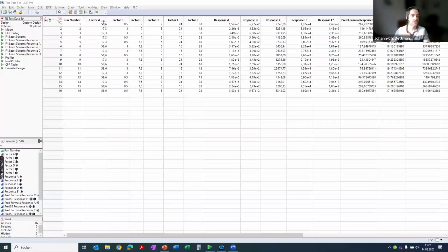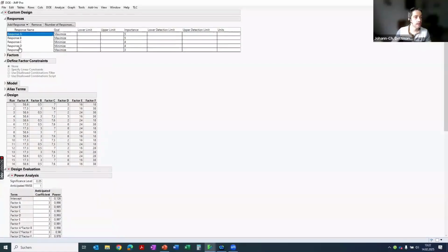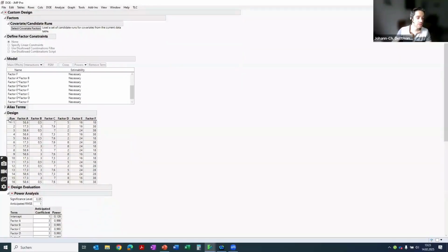Okay, I want to show you today an example which was part of one of our characterization studies. In this DOE, we had 5 different responses. We also investigated 6 different factors, and from our risk assessment, we finally concluded to investigate, of course, all main effects, but we also decided to investigate some of the two-factor interactions and also some of the quadratic terms, leading finally to a DOE study of about 16 runs.